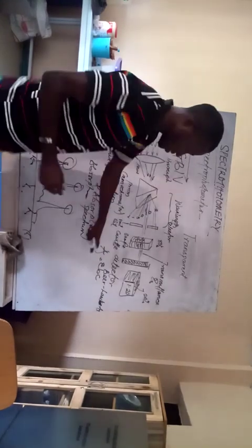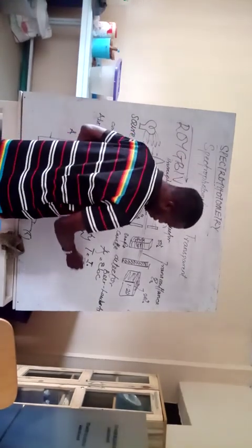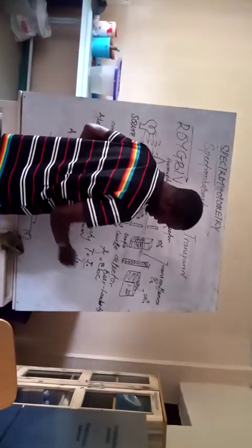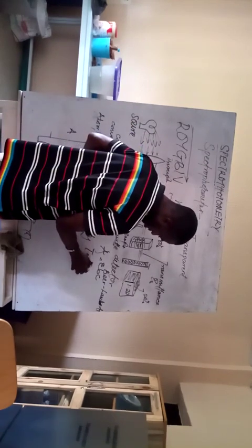This is what is called the coefficient of absorptivity, and b and c. So this is the formula, and the transmittance is given by the intensity of light that is transmitted over the intensity of light that is incident.